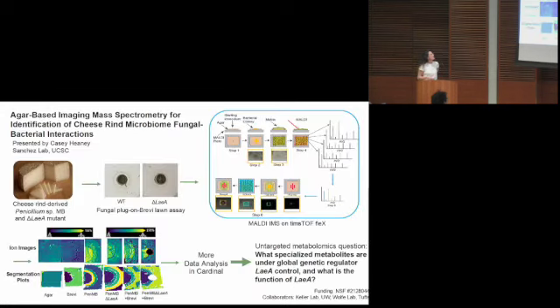I'm from the Sanchez lab, and we primarily use imaging mass spectrometry for a variety of applications. You heard Allison's talk yesterday about squids. We also do ovarian cancer biomarkers, and I study cheese rinds. Why we think cheese rinds are interesting is because they're a really good model system for evaluating microbiomes. They have about 10 to 12 species, whereas other microbiomes can contain hundreds of species, so it's easy to study in the lab, and it's also very reproducible.